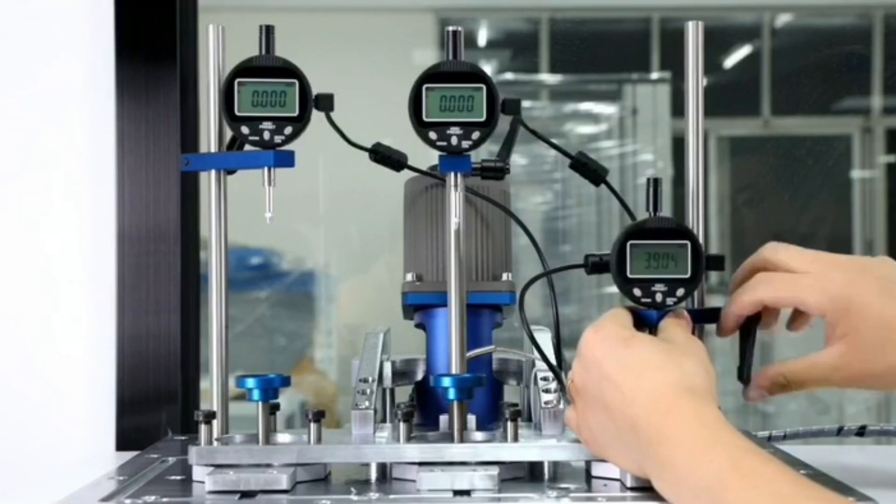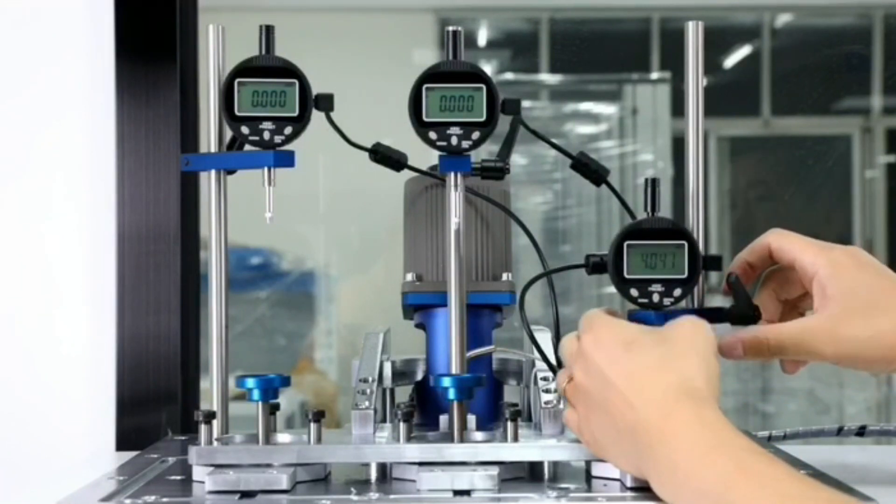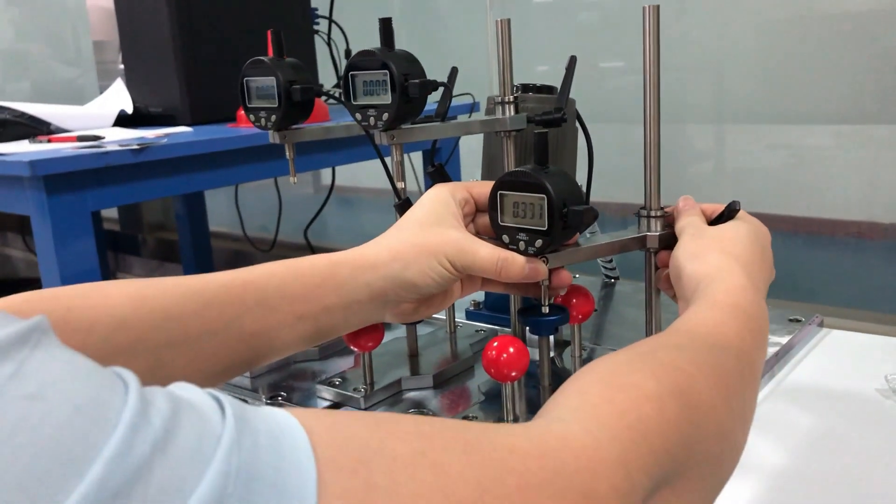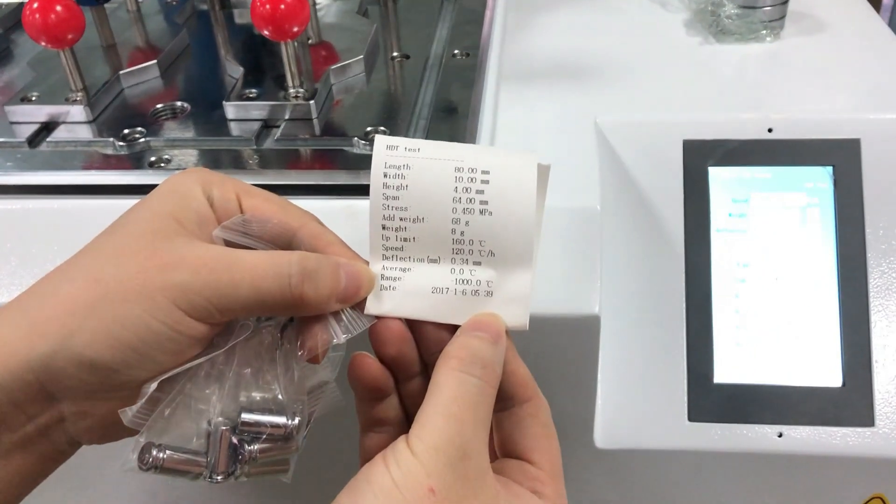Software records real-time displacement and temperature. This is a variety of hard engineering plastics and fiber plastics to carry out temperature resistance tests of the necessary instruments.